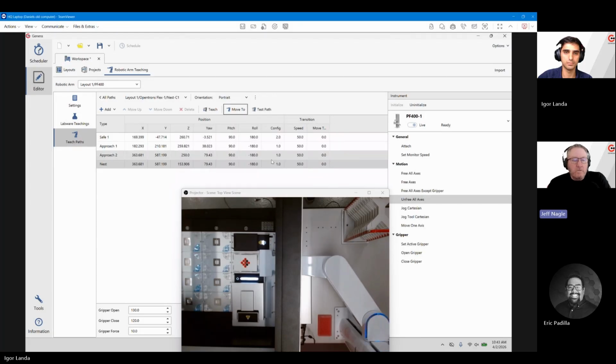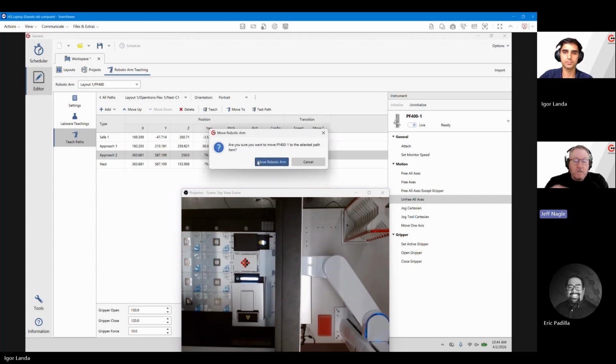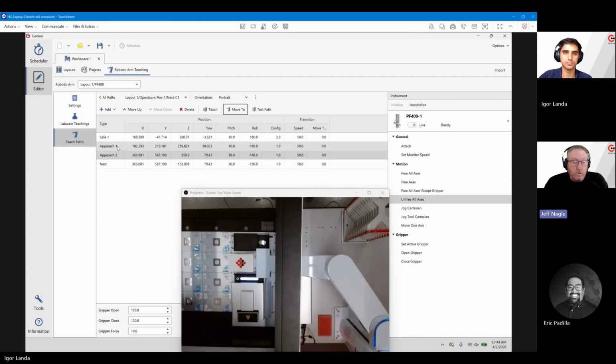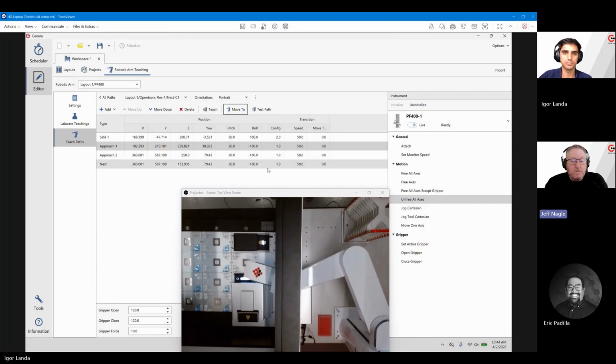Yeah, and it's important to note that the approach that Igor took here, pun intended, was not to change a move type, but to swing the entire arm in above all the devices surrounding that nest position, which is another option. He could have just come up a little bit and moved straight back out like a hotel if he wanted to avoid all that, but he brought it up high enough that it clears all the other devices around that nest position, which is another option.